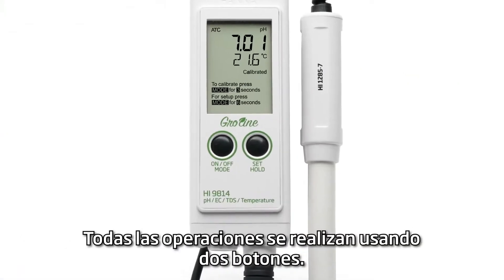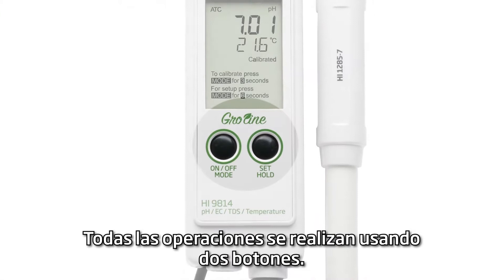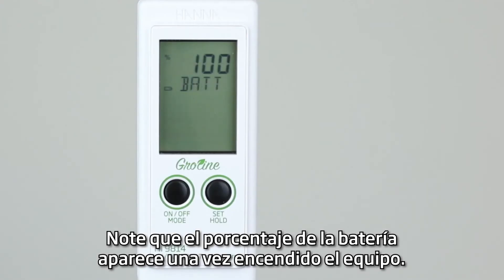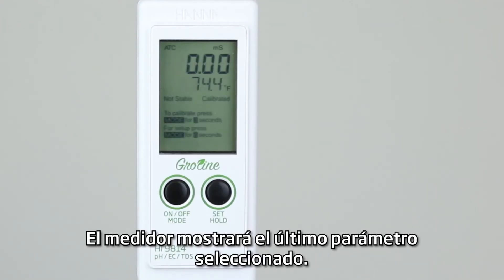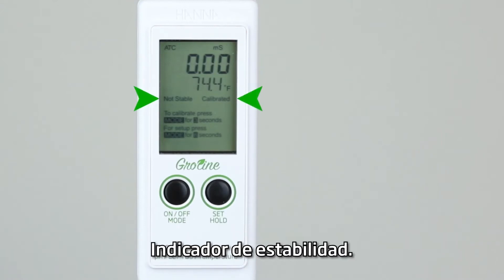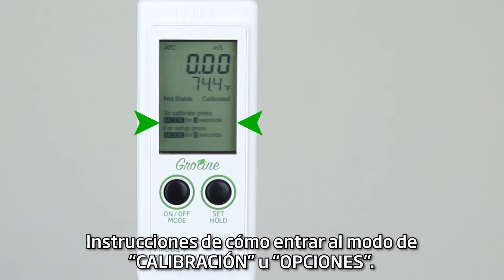All operations are performed through the use of two buttons. Press the on/off mode button to turn the meter on. Note the battery percentage level upon startup. The meter will display the last selected parameter, temperature, stability indicator, and instructions on how to enter calibration and setup modes.